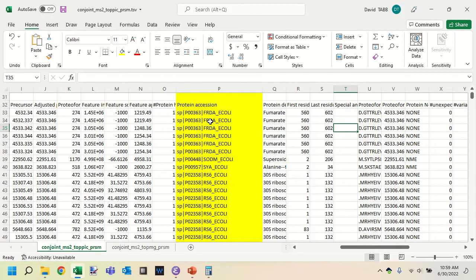So that's all grand, but we're also quite interested in understanding other aspects of this. So what was the amino acid before this proteoform? Well, it's a D. Was that the first amino acid of the sequence in the database? I'm not actually sure. I would need to look at that, but, oh, I'm sorry, here it is right here.